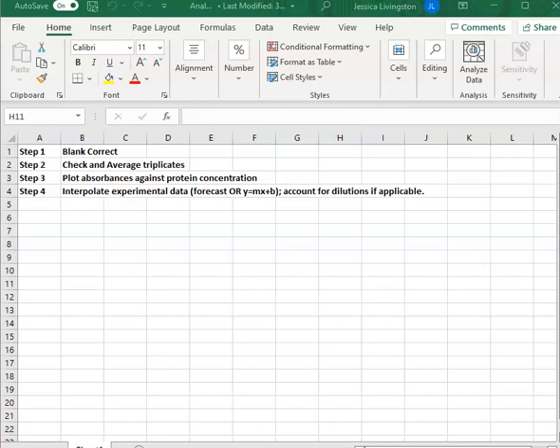Everyone, this is just a quick video to help walk you through how to analyze standard curve data and interpolate unknown samples from that data. Feel free to follow along with your own data and pause and rewatch as needed. There's going to be 4 steps that we go through to analyze this data.